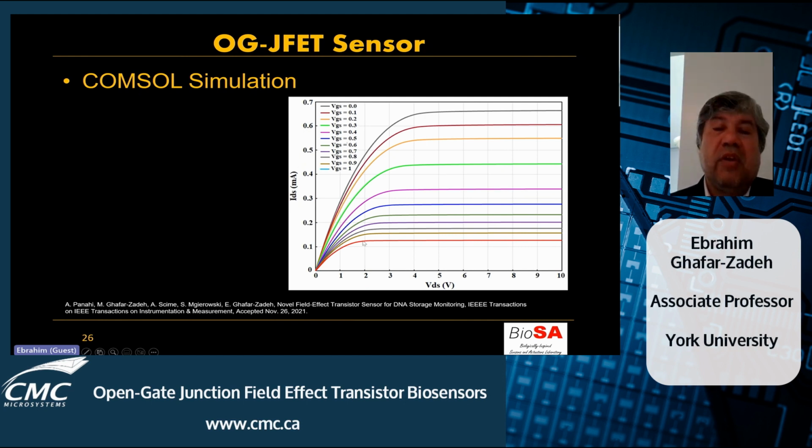However, this area is also informative, because by changing the voltage we can still see the variation of the conductivities between drain and source.